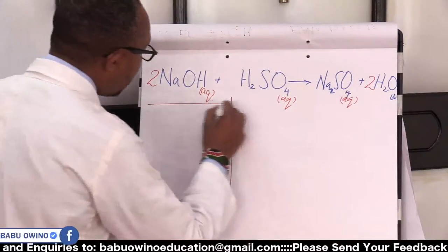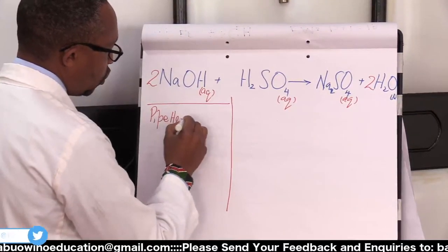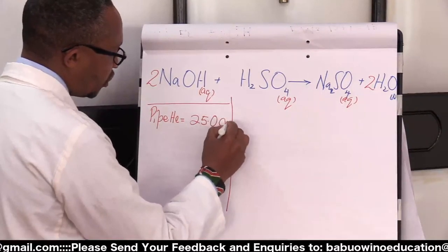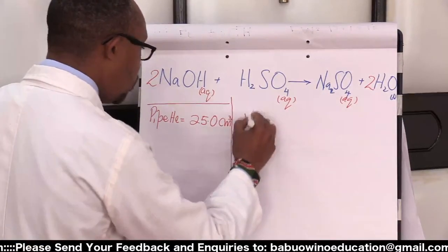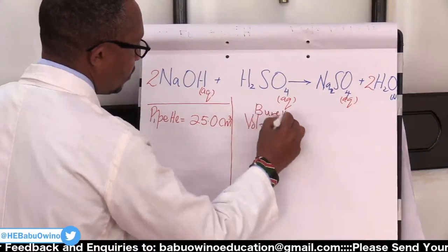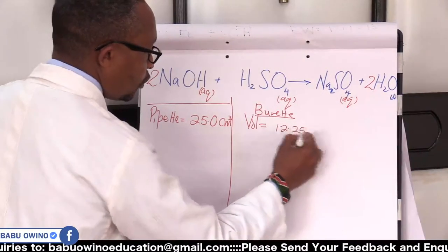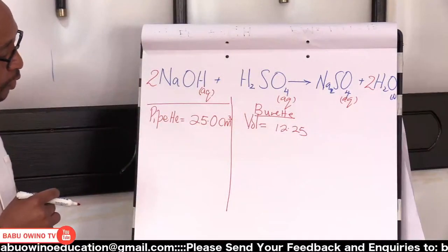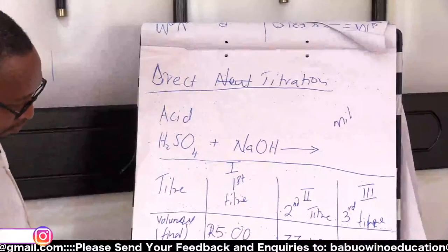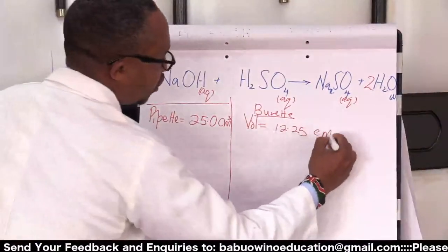So here you have the pipette values. And the pipette in this case was 25.0 centimeters cubed. Then this was the volume of the burette. This gives you the average, 12.25. The value, was it 12.25? What was it? 12.25, correct. Now, this is centimeters cubed.